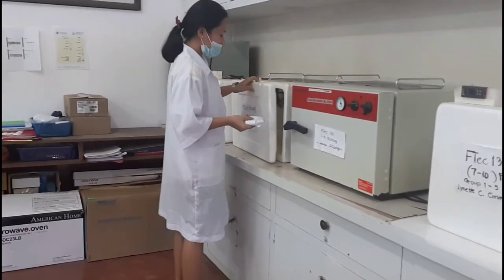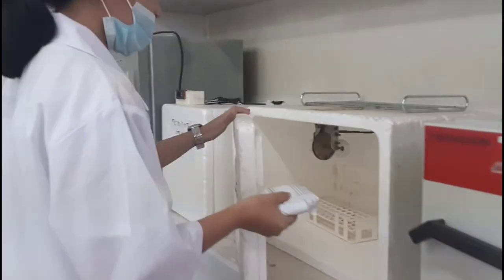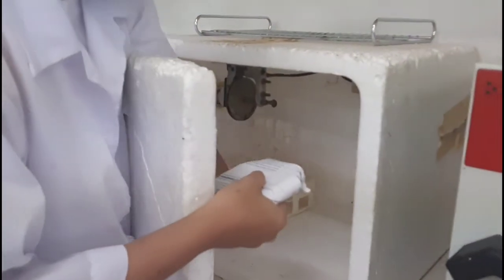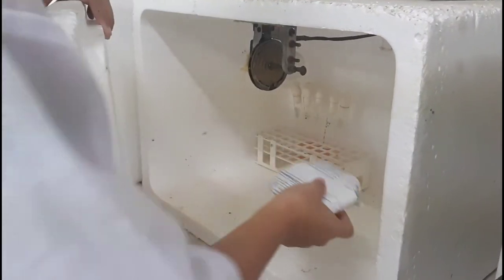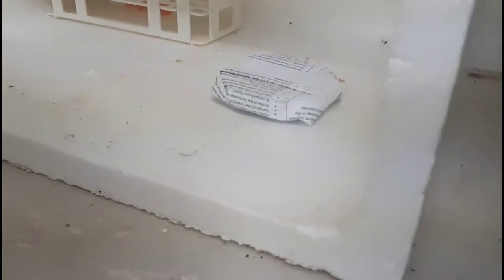Incubate the slide culture at 30 to 35 degrees Celsius. Place it in a clean incubator. Examine the slide culture from time to time until satisfactory development of the mold growth is observed.